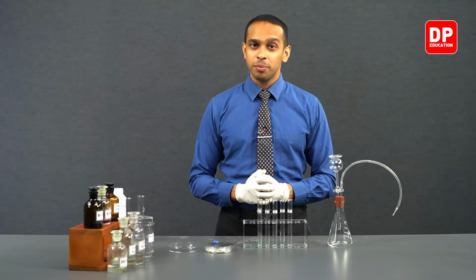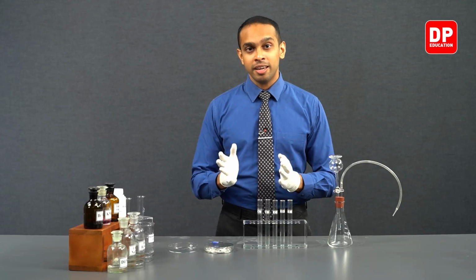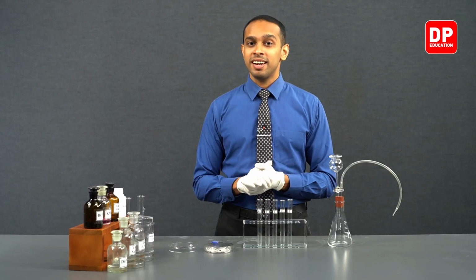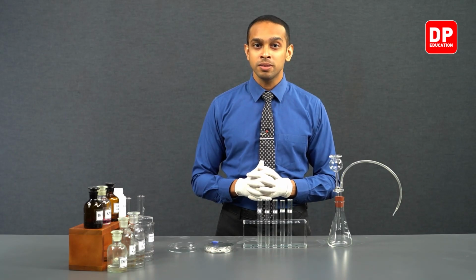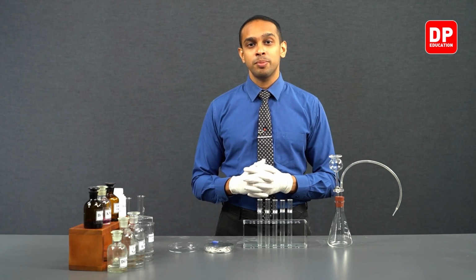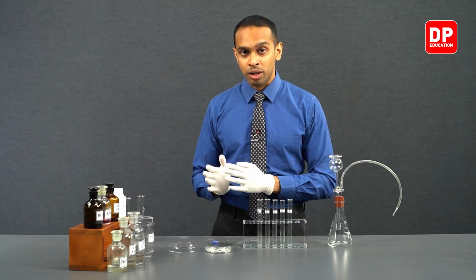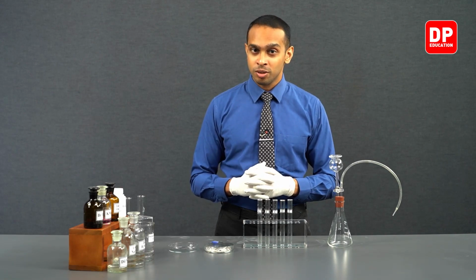Now, in the second part of our experiment, we are going to observe how ethyne or acetylene reacts with different chemicals such as bromine water, acidified potassium permanganate, alkaline potassium permanganate, ammoniacal silver nitrate, and ammoniacal cuprous chloride.